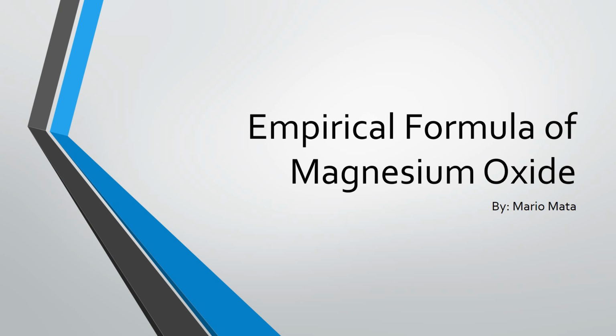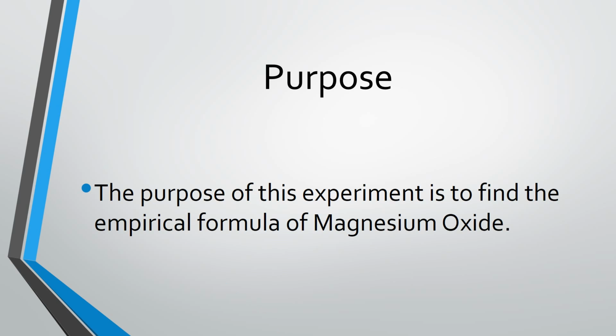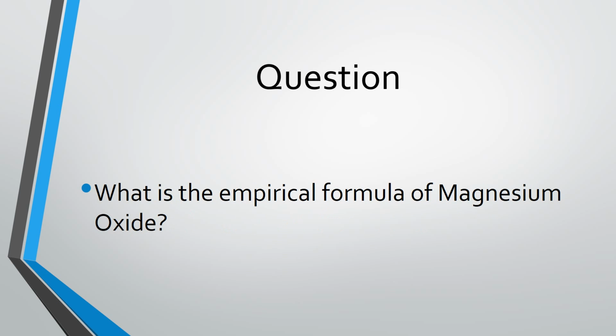My name is Mario Mata, and this is my experiment, empirical formula of magnesium oxide. The purpose of this experiment is to find the empirical formula of magnesium oxide. My question is, what is the empirical formula of magnesium oxide?